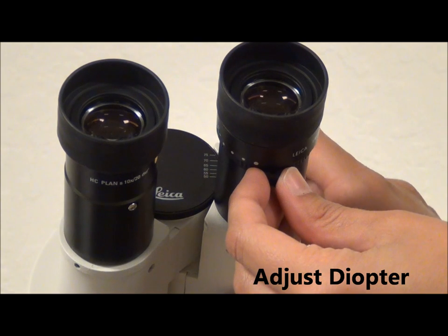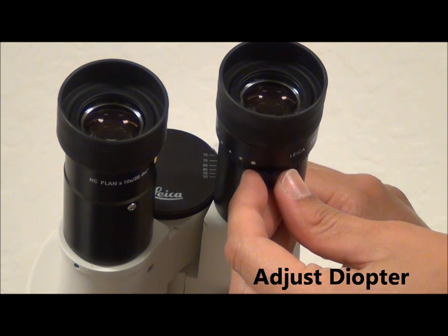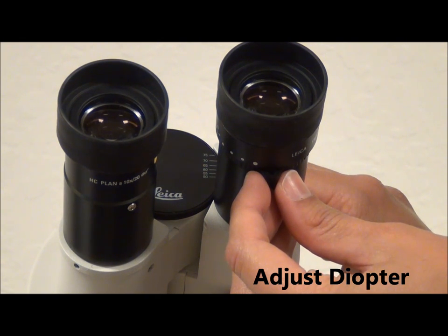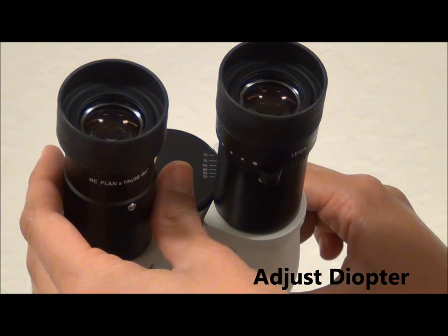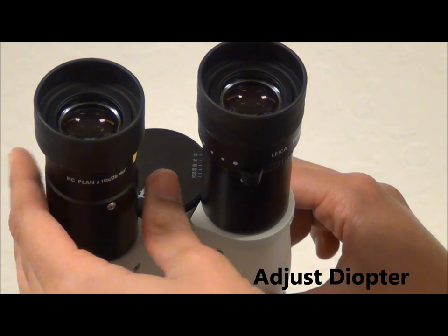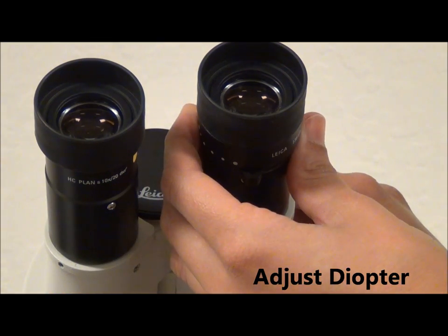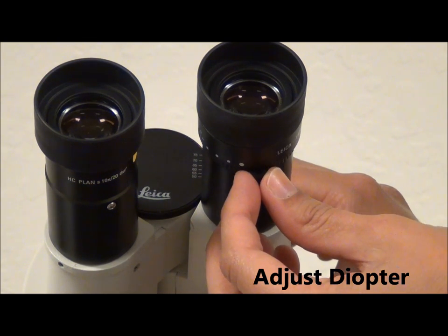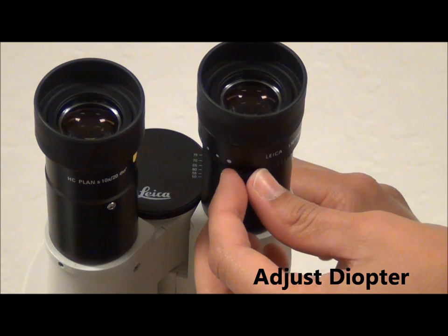This knob here is the diopter adjustment. It's used to compensate for differences between eyes. One of the oculars has a diopter ring, and before using the microscope, each user should adjust the diopter ring in order to get the best image and avoid eyestrain. To do this, first you focus on your image with the focus knobs below using the non-diopter eyepiece, and then you look through the diopter eyepiece and focus on the image by moving the diopter slider. If you have equal resolving power in both eyes, your diopter will be set to zero.